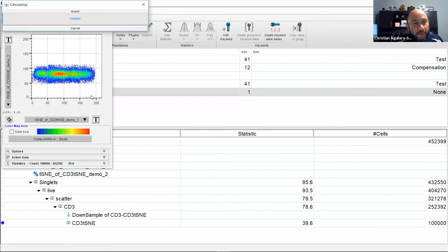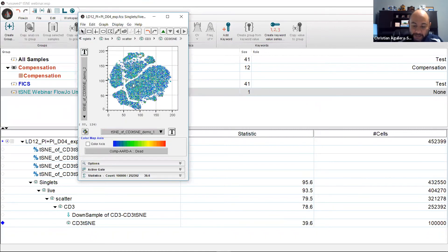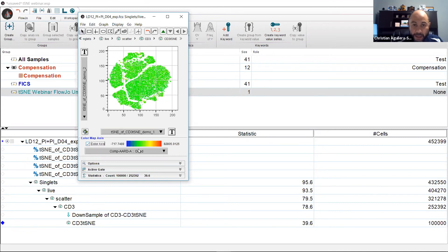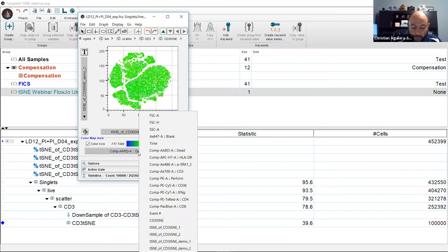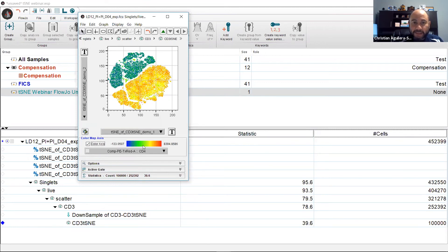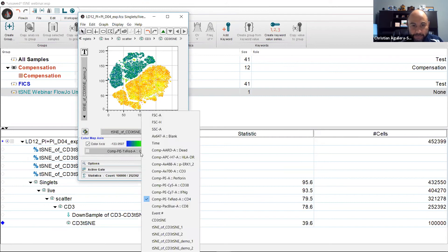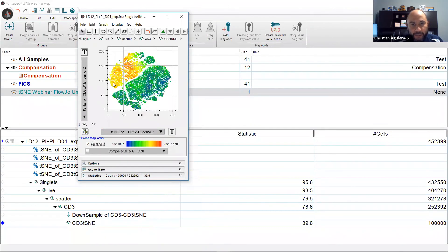So now that we have this t-SNE map, let's explore each island by selecting the color axis first like so and then selecting from the drop-down menu a parameter of interest. For instance, let's see where our CD4 cells are. Well, they're denoted by this red as shown by this heat map down here which illustrates the fluorescence intensities. Now let's see where our CD8s are at. We'll do the drop-down and select CD8. That's these cells up here.